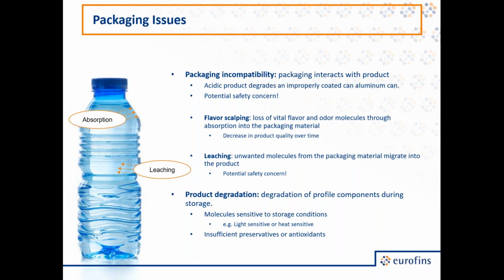Another common packaging issue would be just using packaging that isn't sturdy enough or isn't sealing properly. And there you can get the packaging to start to break down, or you might get some damage to the packaging, which allows material to leach into the product. And this can lead to contamination.